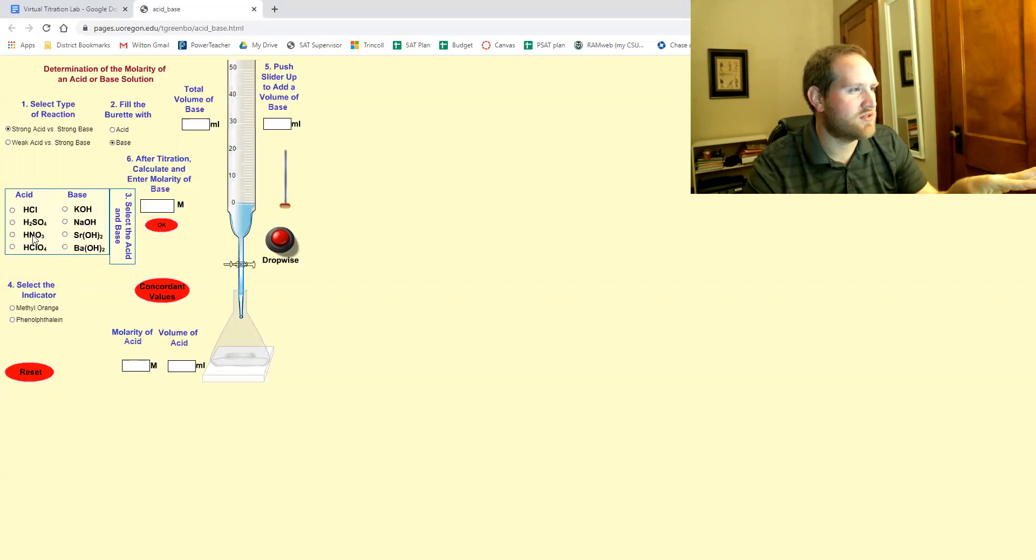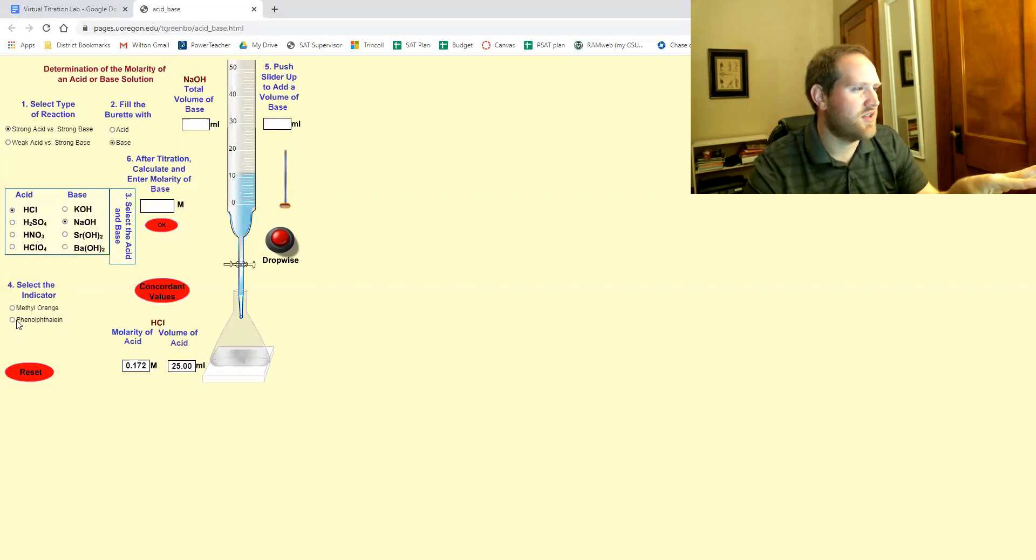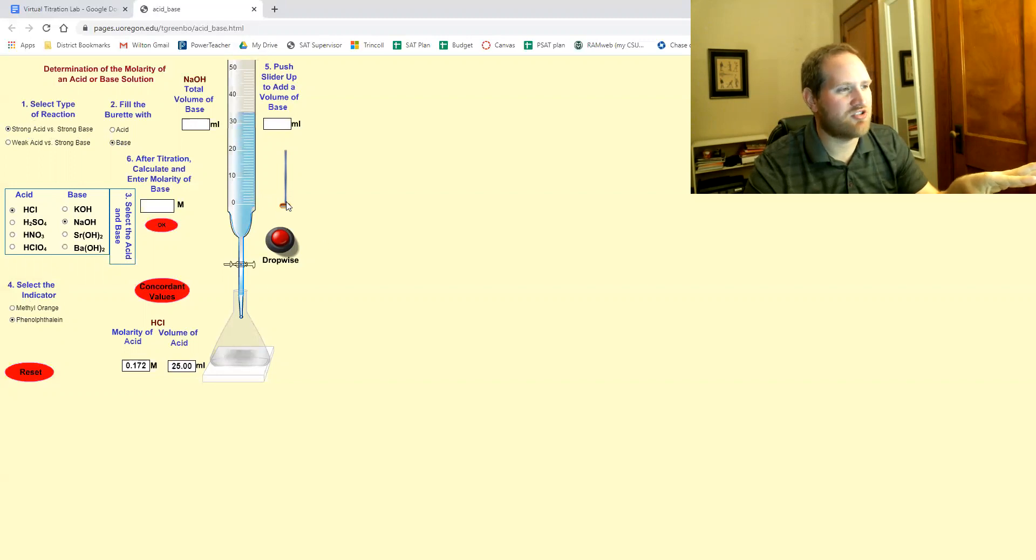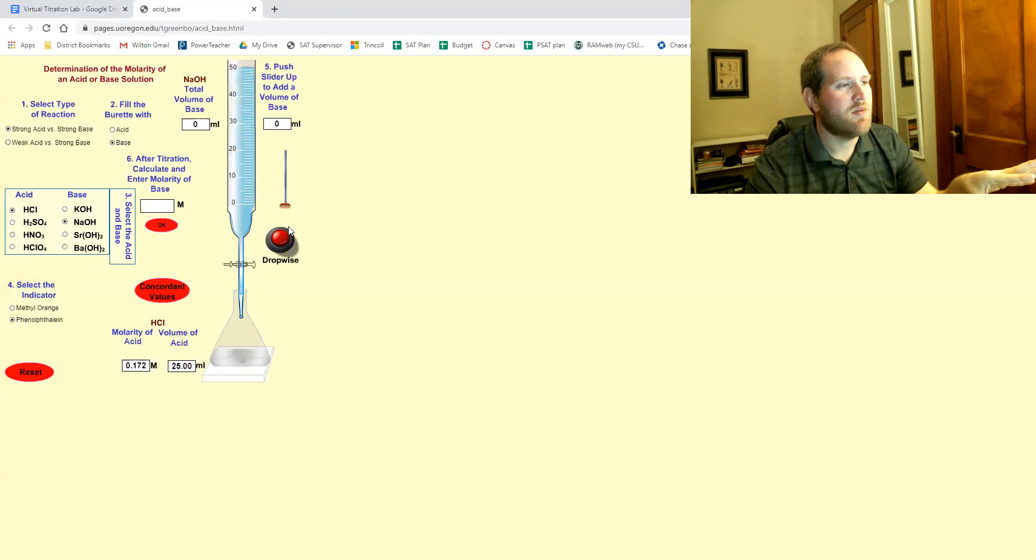like we'll go this, this, this, this, and this. Sometimes it didn't allow me to actually add any base. Let's see if it does it this time. Actually this is okay.